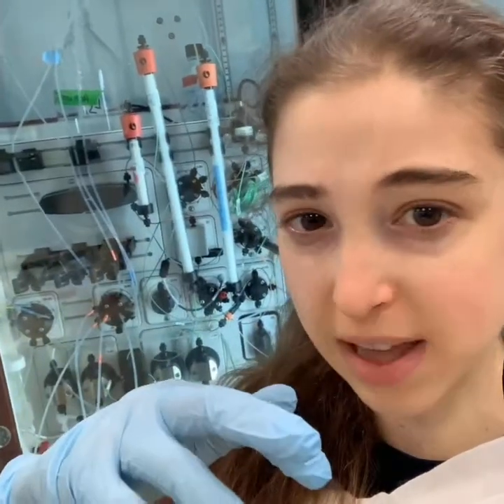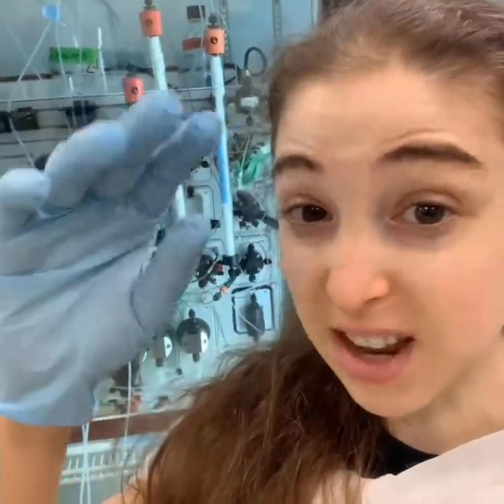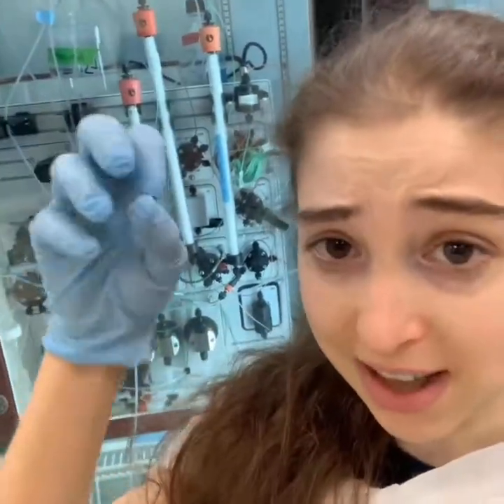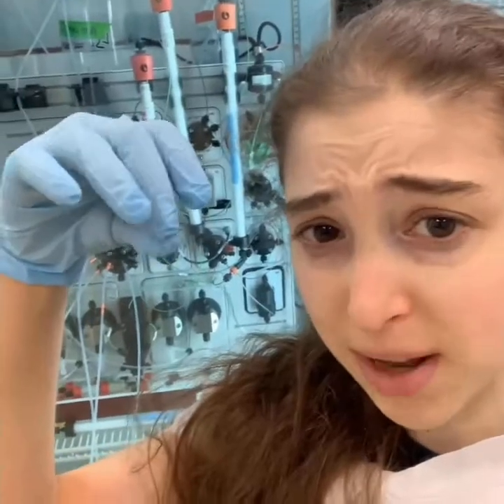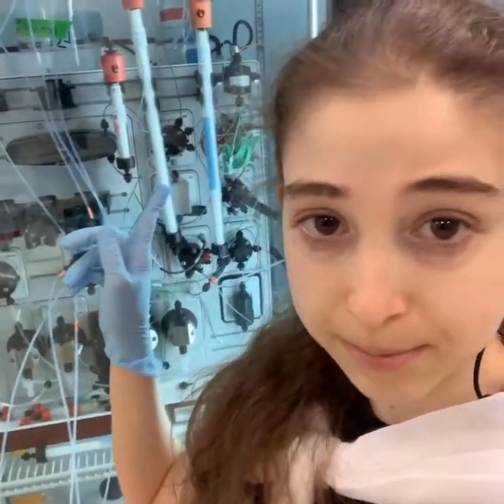So what chromatography is, is this idea that you take two things and you have a stationary phase and a mobile phase. And you have something in the mobile phase that goes through the stationary phase. With FPLC, what we're doing is we're doing it in columns. These columns are filled with these little beads called resin. And there are different kinds of resin that interact differently with different things.